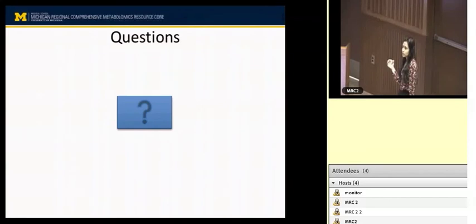So what you can do is pick based on retention time, the internal standard which is nearest to the compounds that appear in that region. Or you have to try and see which method works out. That's the general approach. You can use retention time based, or RSD based, the ones that reduce your variation. That's why there are different things that I have listed.